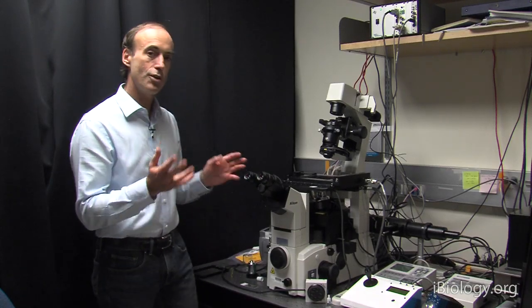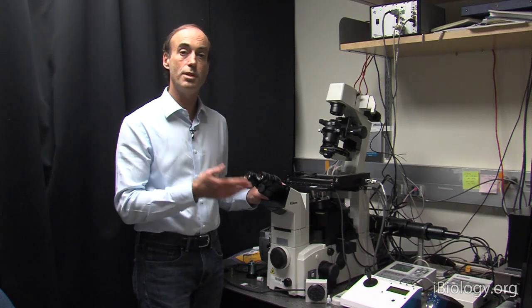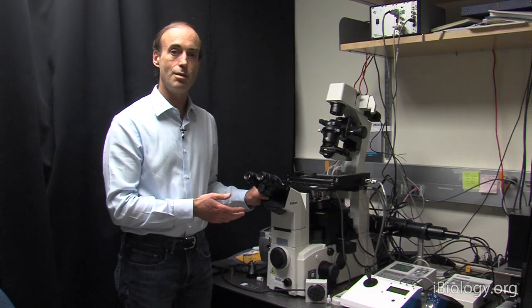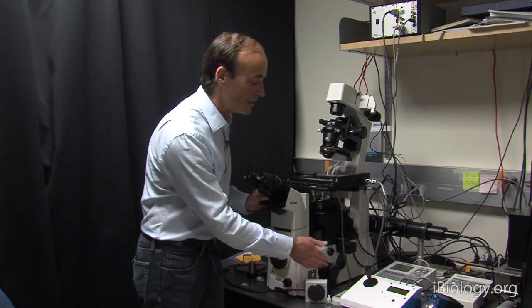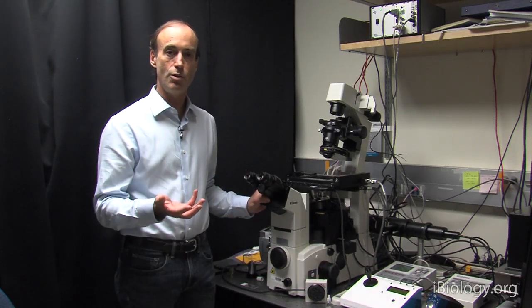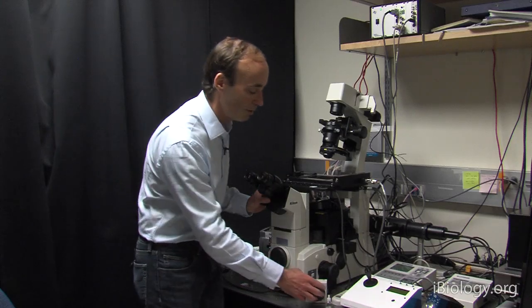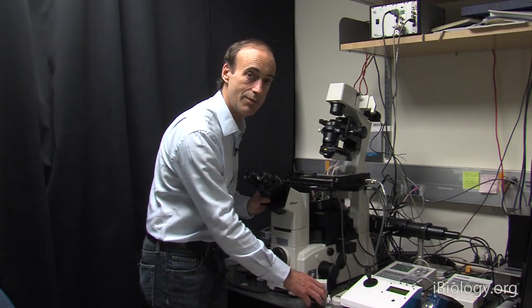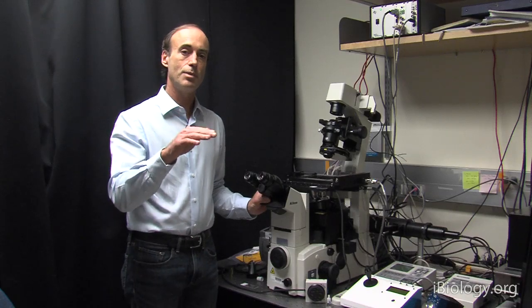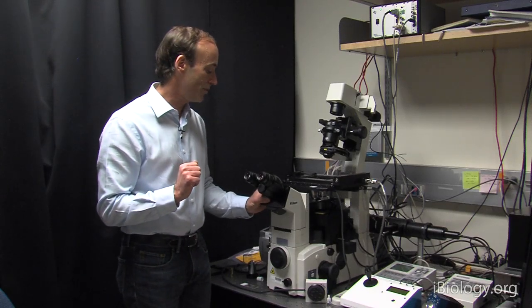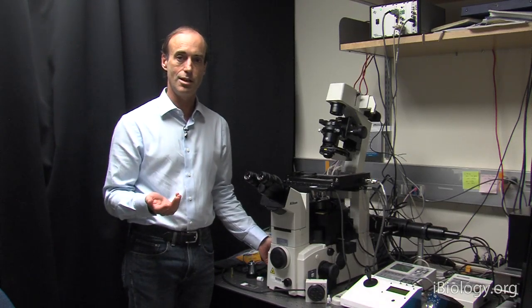The first thing you want to do is become familiar with the focusing knobs of your particular microscope. In this microscope, on the right side is a fine focusing knob with a remote focusing device that allows us to fine tune the level of focus. And on the left side is a coarse focusing knob.